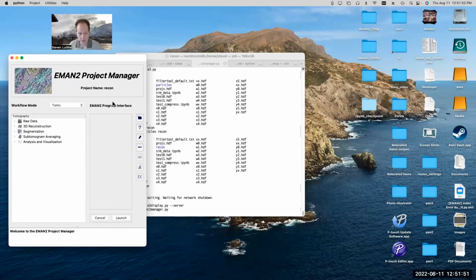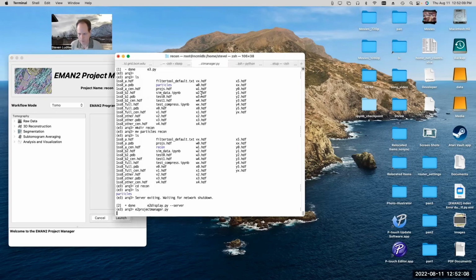And I'm just going to be following stuff from the tutorial here. So I'll get sort of the first step started here, and then we'll end the session for today. And then next week we'll try and import that session into the GMM tool.